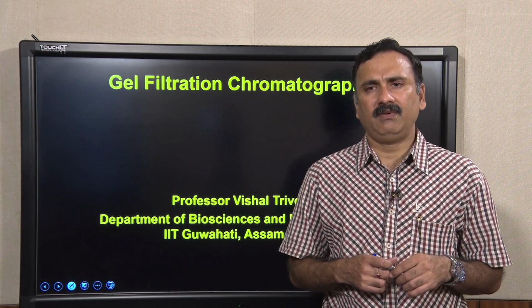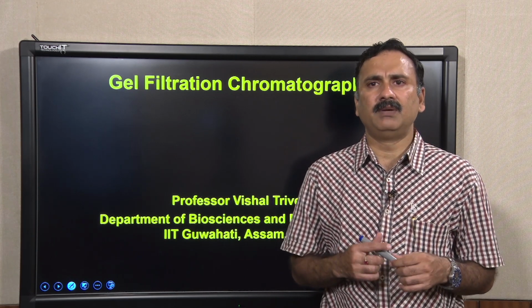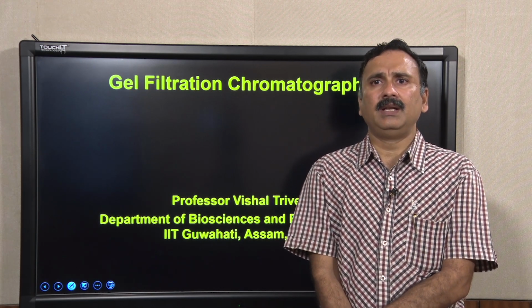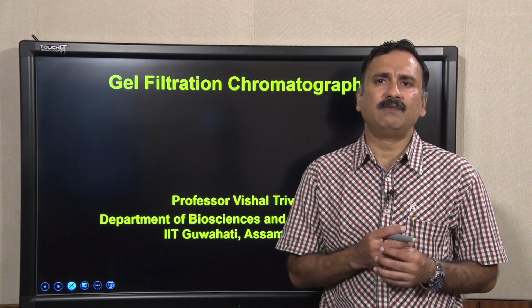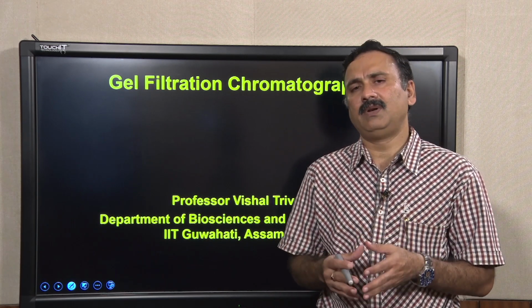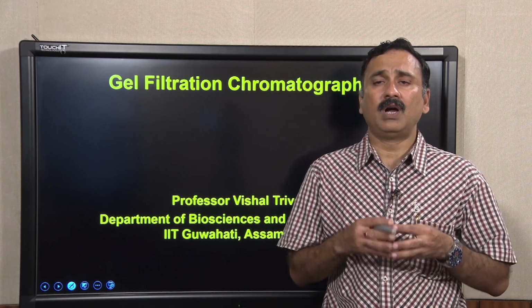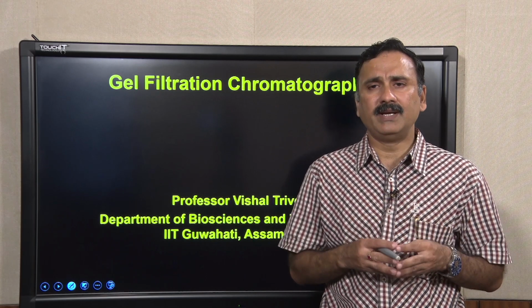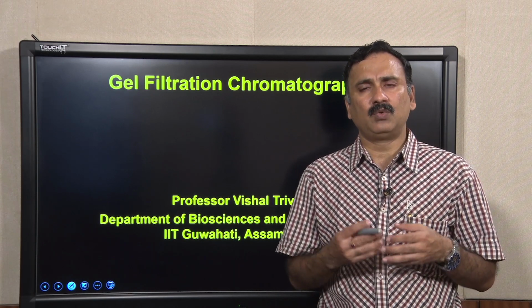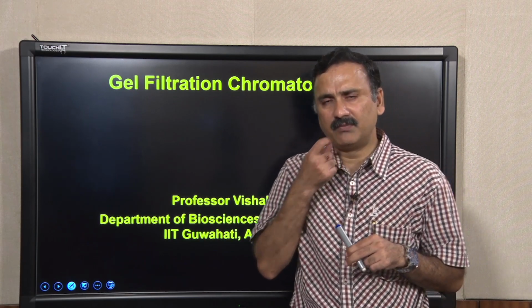And what we were discussing was gel filtration chromatography, and in the previous lecture we discussed the basic principle of gel filtration chromatography, how to pack the columns, and what the different aspects are that you have to consider while you are running the gel filtration column or maintaining a packed column. Now, in today's lecture we are going to discuss how you can exploit gel filtration chromatography to answer some scientific problems. So, in this series let us discuss the first problem.